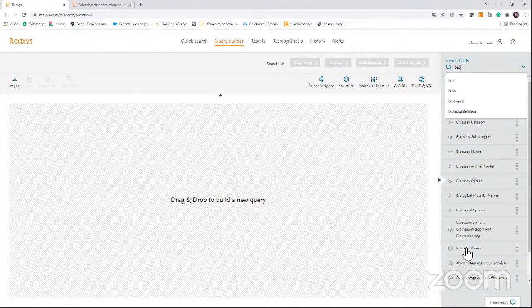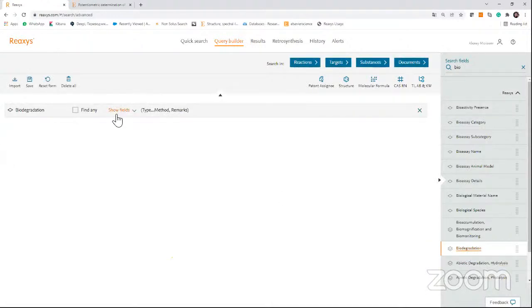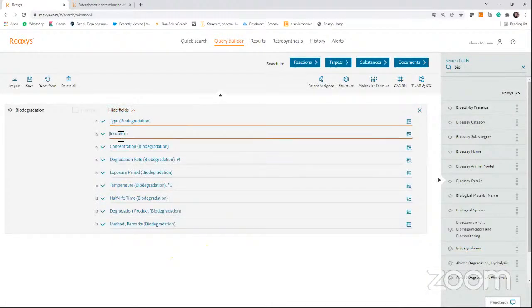We have, for example, a biodegradation filter. We can place here an inoculum with bacteria used for example for biodegradation of some plastics and so on. If you want to make some methodology for destroying some materials like plastic or something else, you can use this filter.